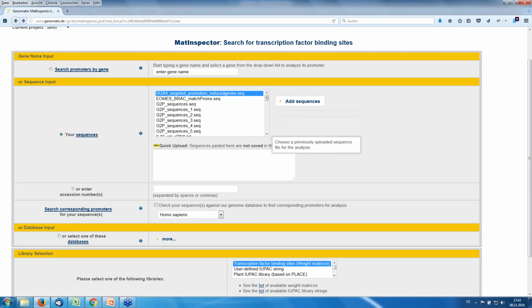which, well, we would expect to also have maybe a corresponding binding site in the promoter. And if you use this set of promoters, 44 promoters, you can expect to have several thousands of matches, as you typically have approximately 300 matches per promoter. With 44, you can expect to have about 12,000 matches.